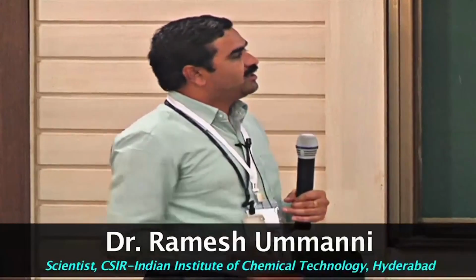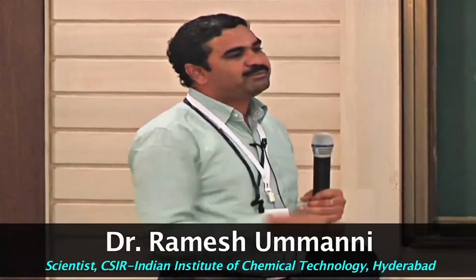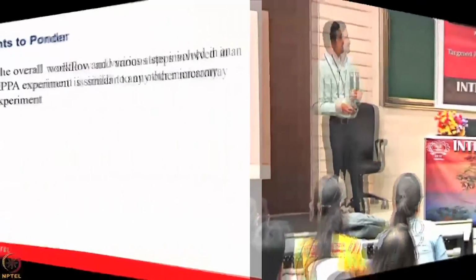Then obviously you can design, or you can draw a heat map, you can see what are the different clusters of proteins that are altering among the proteins I tested, whether they have any relation or no relation.